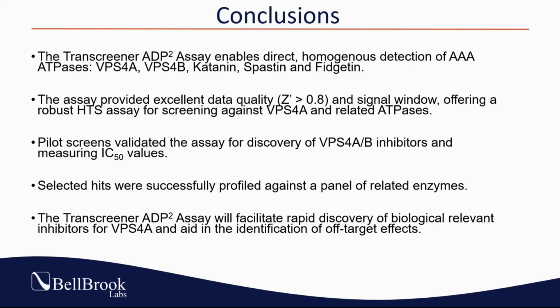Broadly speaking, what this shows is that our assay platform can facilitate the rapid discovery and validation of biologically relevant inhibitors for VPS4A and other clinically important targets, and aid in the identification of off-target effects, which is crucial for guiding structure-activity relationship and development.